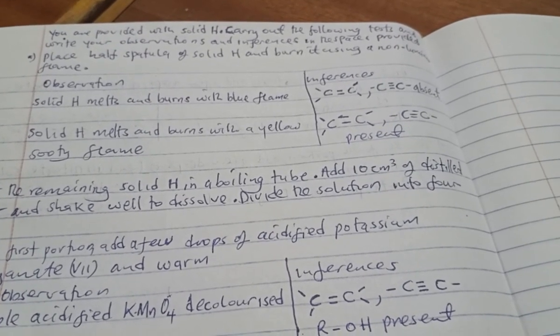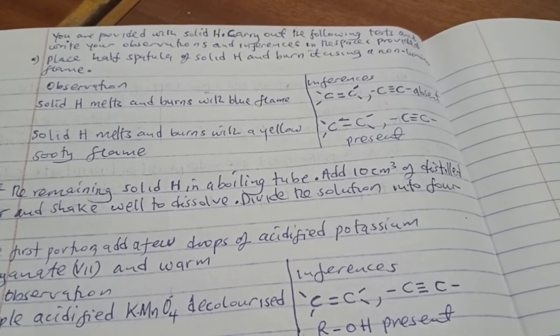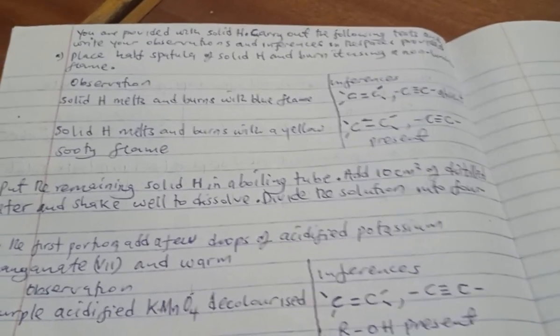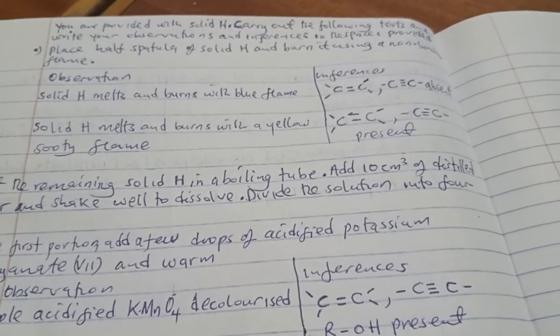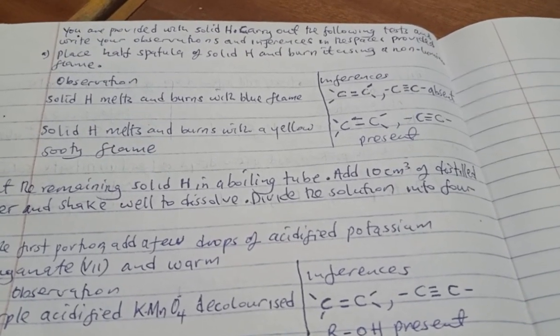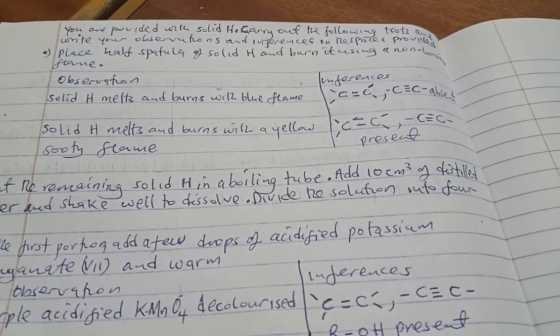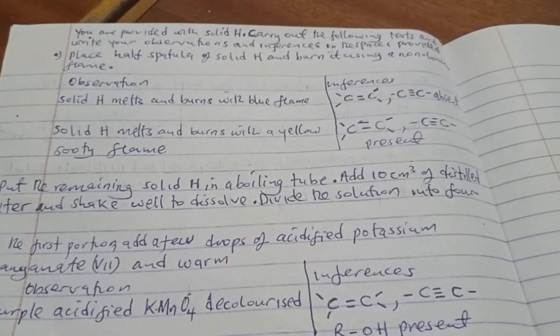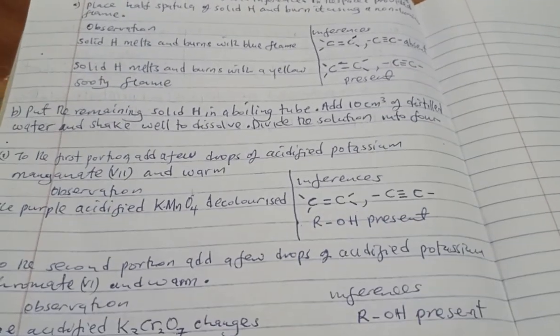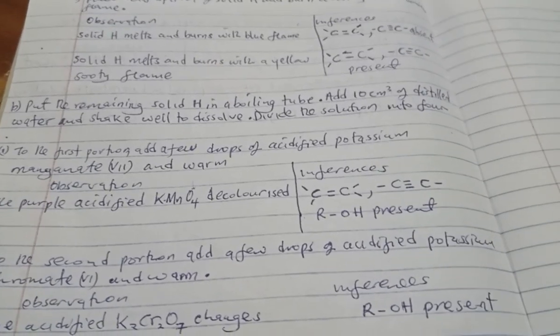Then we can say the double bond and the triple bond are absent, meaning we only have the single bond. If it melts and burns with a yellow sooty flame, then the double bond or the triple bond is present. That one you have just tested by burning. You can burn on a watch glass or on a spatula. You just follow instruction.